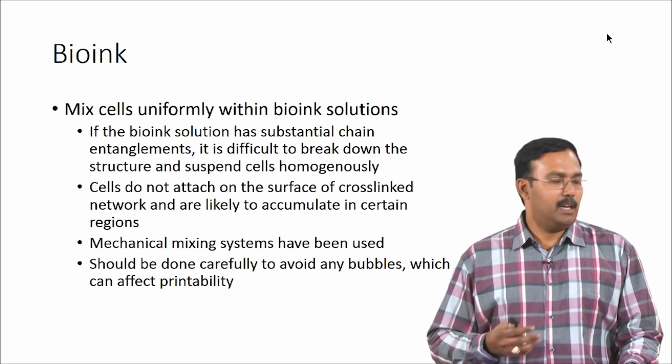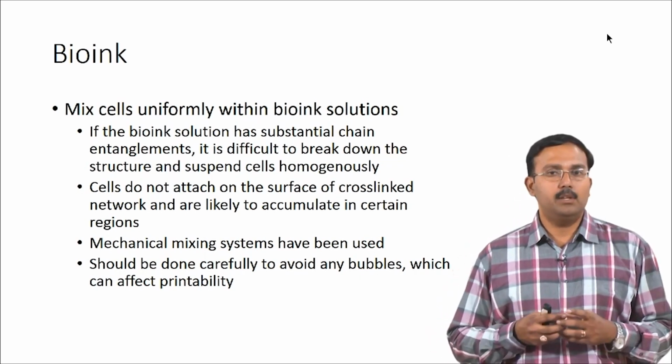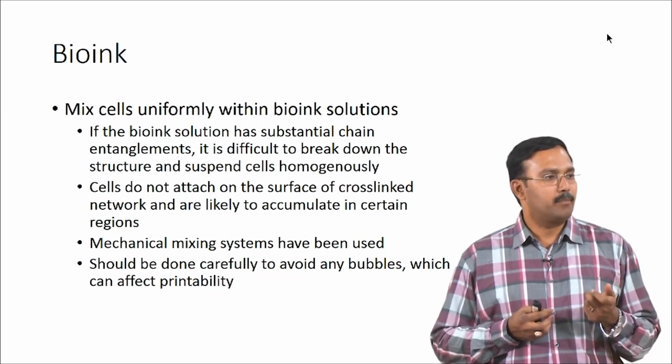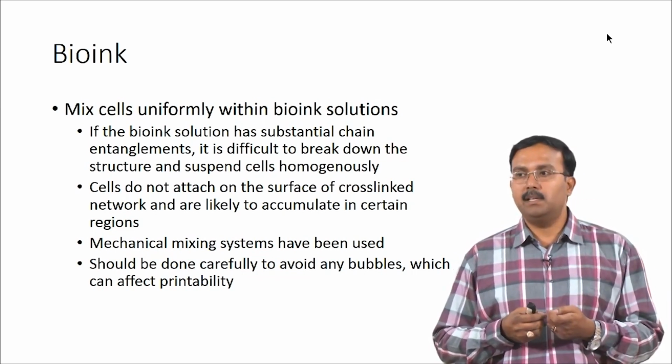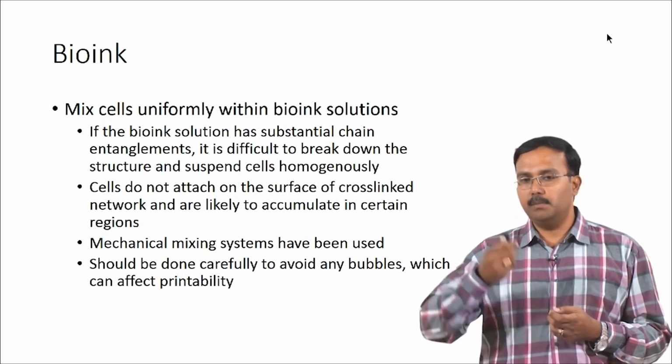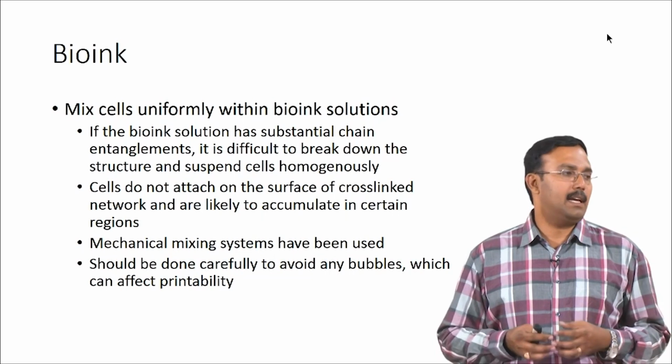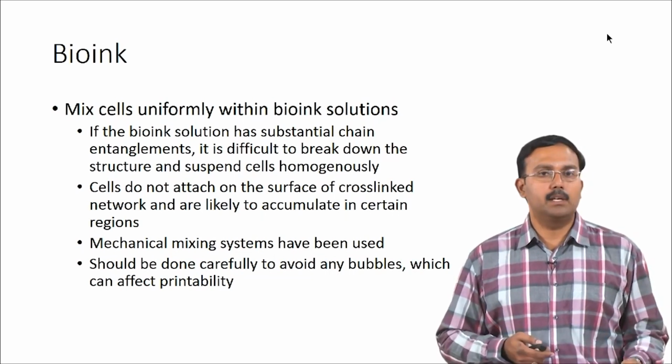In addition, it should also be done very carefully so that you do not have any bubbles. If you have bubbles, it affects the printability. While the ink is being printed, you should not have any bubbles; it should be a uniform flow of the ink. These are things which need to be taken care of while you are preparing a bio ink.